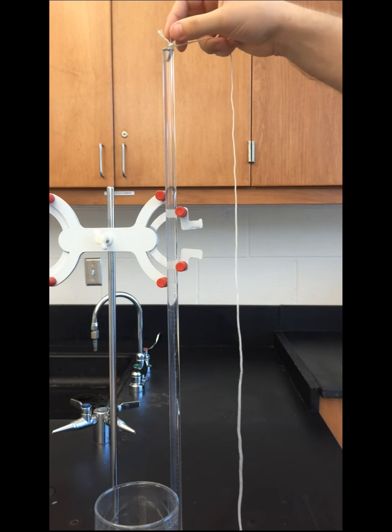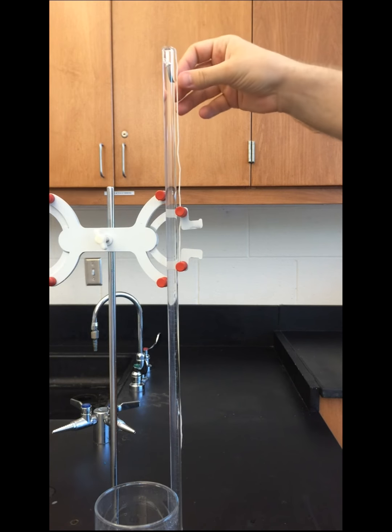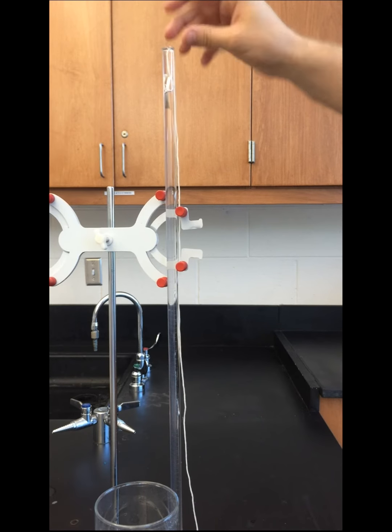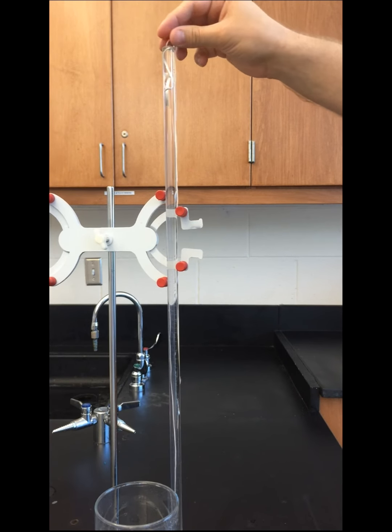The magnesium is then inserted down into the eudiometer below the water level. You'll usually want it to go a couple centimeters down below, just to make sure the magnesium stays in the tube and doesn't fall out during the next process.